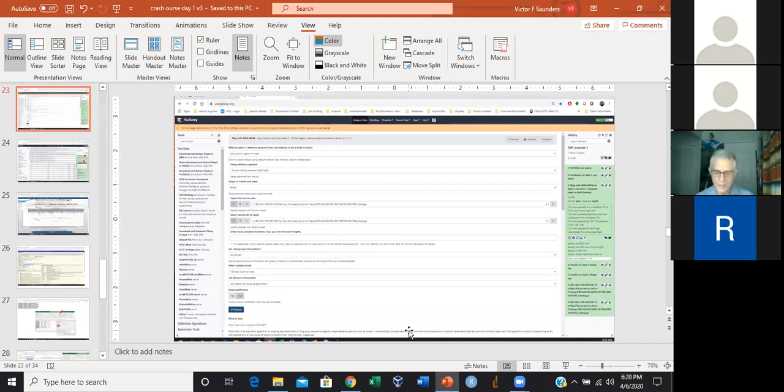Yes. Well, a sequence is a stretch of bases, A, T, G, C, repeated over in myriad combinations. And so the whole point of doing the next generation sequencing is to pile up enough of the reads so that once you've finished and you've aligned them all up, you have good confidence that your consensus sequence is the correct one. And it's also where you check to see where there are variants.